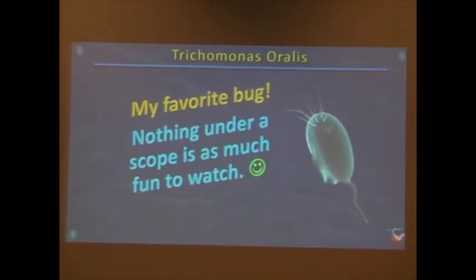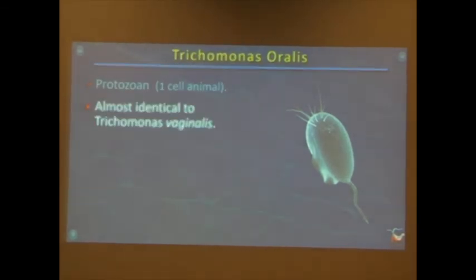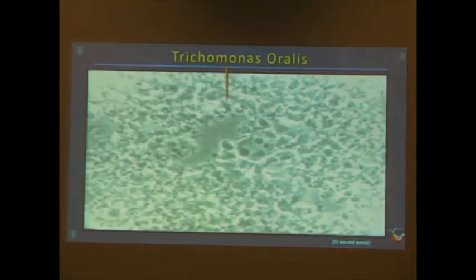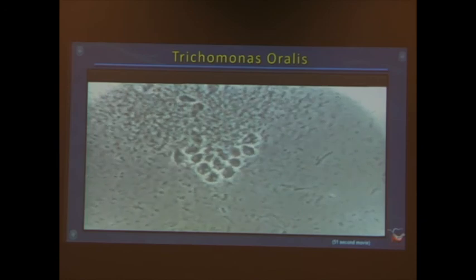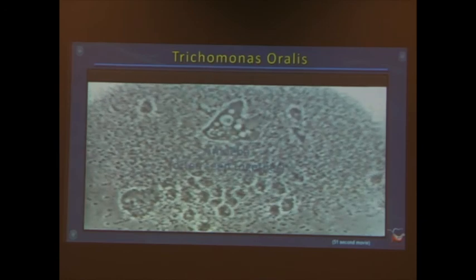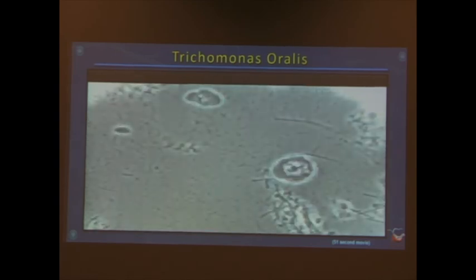My favorite bug of all time, the trichomonad. I coined a new word, I think. Very similar to the same organism that causes vaginitis. And this is what they look like. I get calls all the time from clinicians saying, I've seen something weird in my microscope. What is it? Send me a little video. And sure enough, it's usually a trichomonad, a one-celled animal. I swear to heaven, if these things were as big as a collie, I would buy one as a pet.